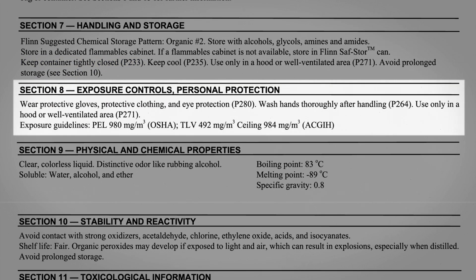Section 8 is about personal protection, specifically the use of personal protective equipment, or PPE. The information here reinforces important safety rules: wear protective gloves, protective clothing, and eye protection to avoid eye and skin contact with chemicals.